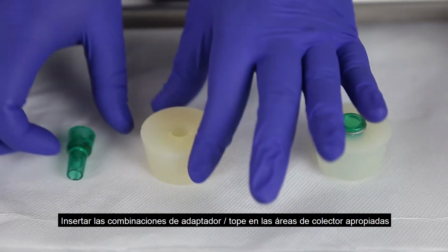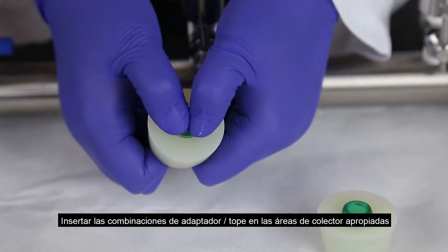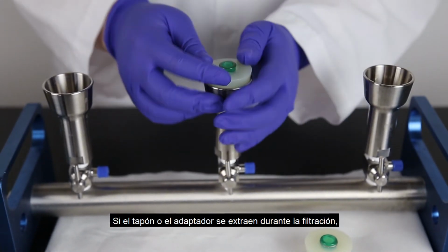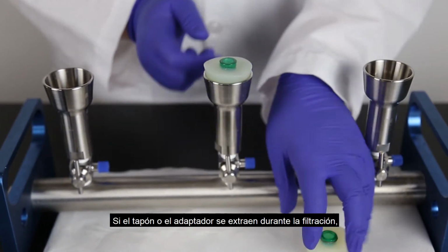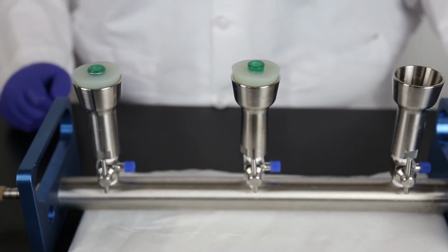Insert the adapter-stopper combinations into the appropriate manifold areas and press down firmly. If either stopper or adapter pulls out during filtration, just reinsert it. This won't cause any issues.